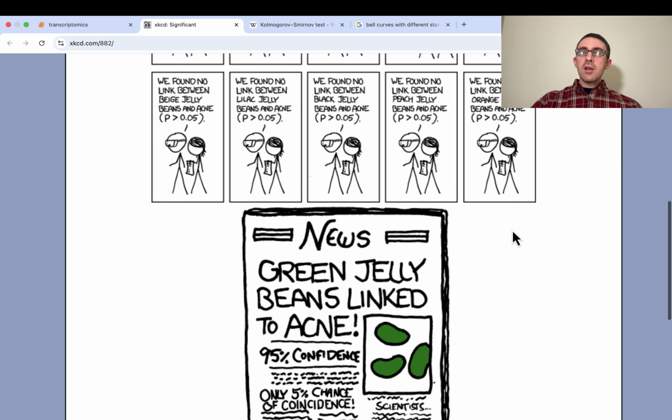Let's say that it was a mean of 4 for IPF and a mean of 2 for the control. And then what would happen if we added a very large constant to both the top and bottom of the fraction? Then we'd be getting a fold change close to 1, right? Because the top and bottom would be almost the same, and then we'd be getting a log2 fold change of close to 0. So actually, that's an extreme example, but even adding a small constant, the effect it would have, if any, would be to make the difference between conditions slightly more diluted.